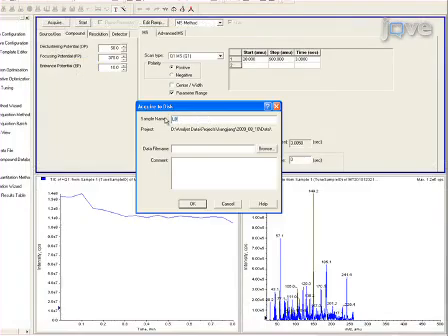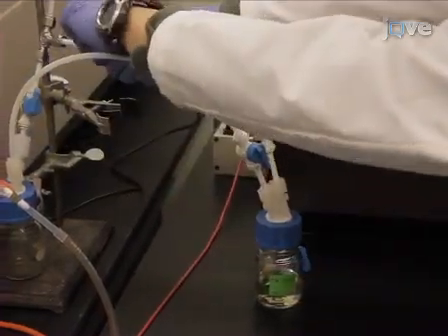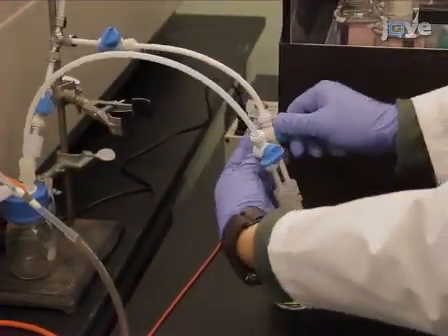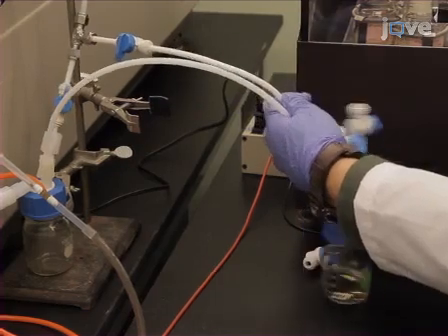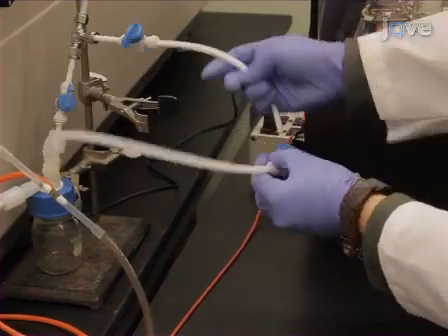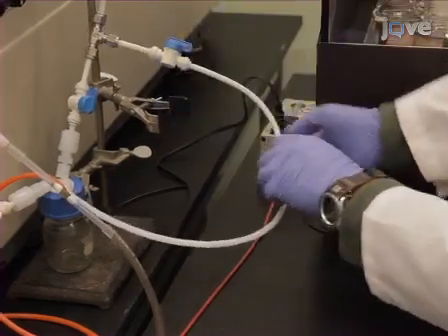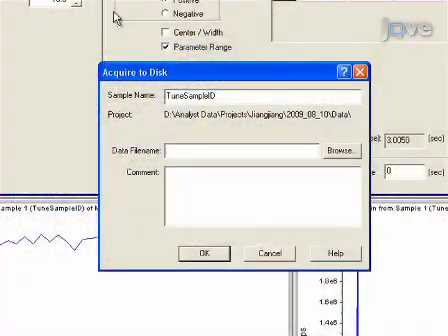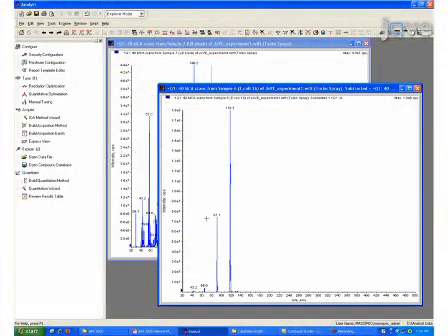After the spectrum is collected, remove the sample bottle by first opening the carrier gas bypass lines, then closing the sample valves, and lastly removing the sample bottle. Flush the system with the carrier gas for 2 to 4 minutes to remove the moisture and adsorbed volatiles from the transfer lines and prevent sample-to-sample carryover. Collect volatile fingerprint data for each bacterial sample, intermittently collecting additional blank spectra to ensure thorough blank subtraction.